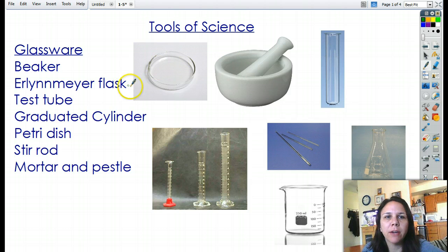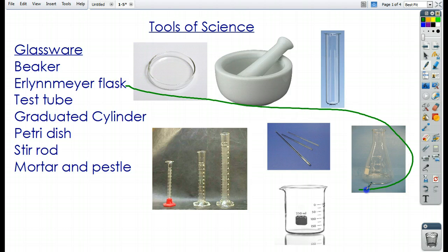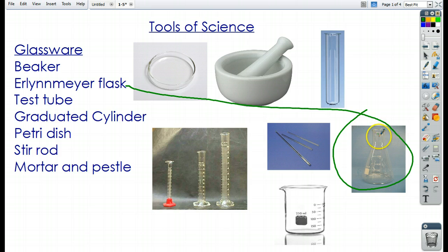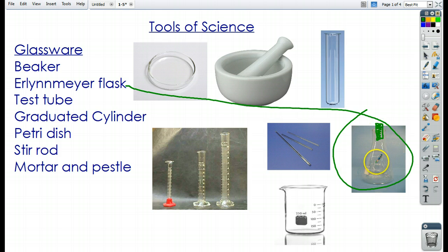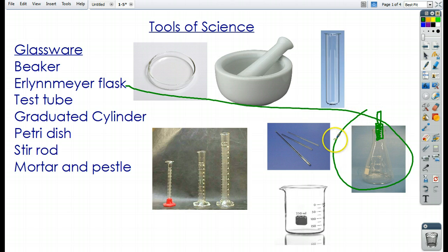The next one is called an Erlenmeyer flask. It's very similar to a beaker. It has more of a triangular shape and a narrow top. What this narrow top allows it to do is to put stoppers inside — either a no-hole stopper if we want a reaction to occur and stay inside, or ones with little holes in them where you can put glass tubing through them.